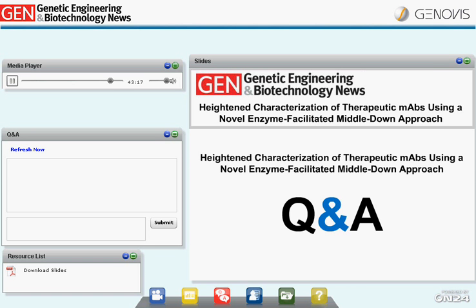Well, the only known substrate today is IgGs, human IgGs and some of the other IgGs like rabbit and some of the mouse, as I mentioned. The specificity is extremely high, so even if you have a very complex pool of glycosylated or other types of serum proteins or growth media, if you throw the enzyme in, it will only cleave the IgGs.